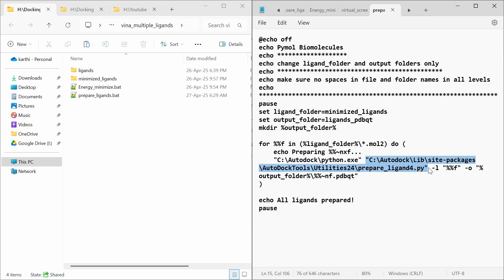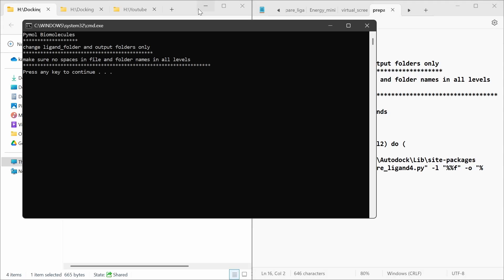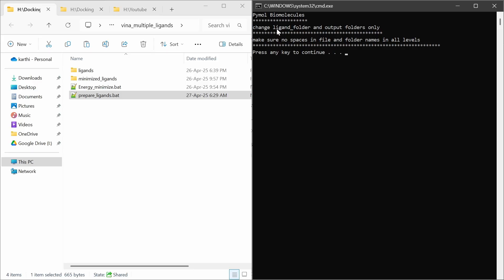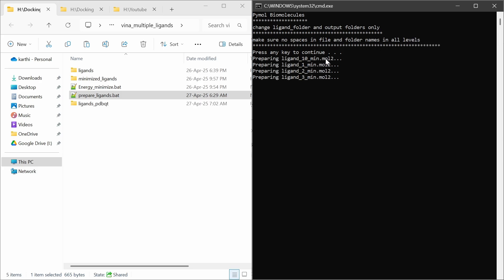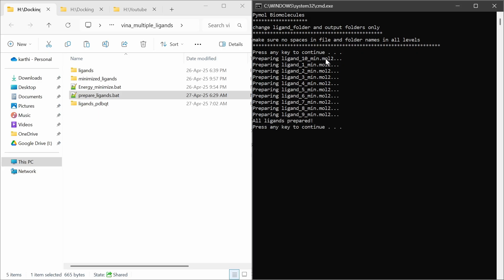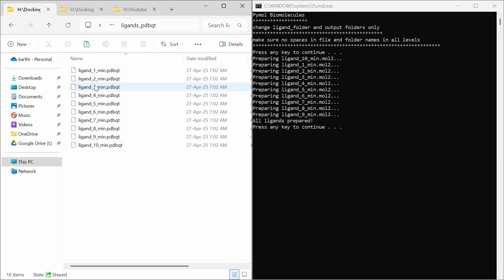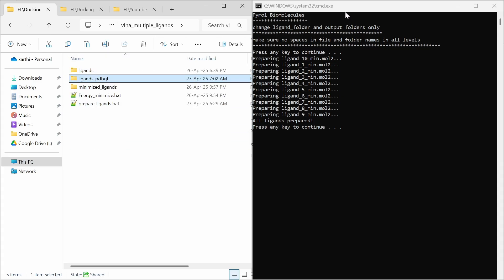In your AutoDock installation path there will be a python.exe. Give that python.exe path and give the location of prepare_ligand4.py, along with these parameters, and save it as a batch file. Double-click to run this batch file. Change the ligand folder and output folders, and make sure there are no spaces in the file and folder names. You can see ligand preparation starts — ligands are prepared and saved in pdbqt format. The mol2 files are converted to pdbqt format. You can see these are the 10 files — ligand preparation is complete.